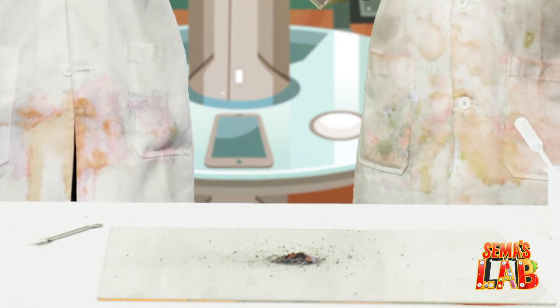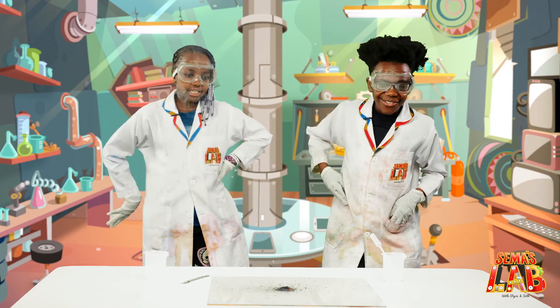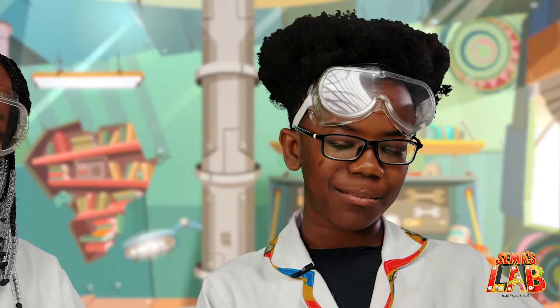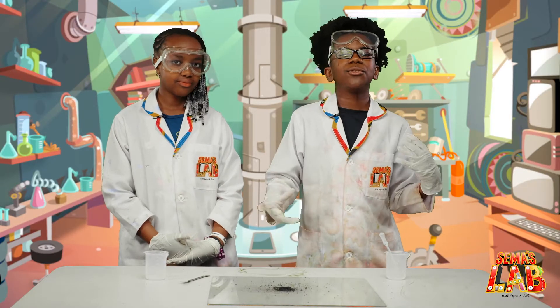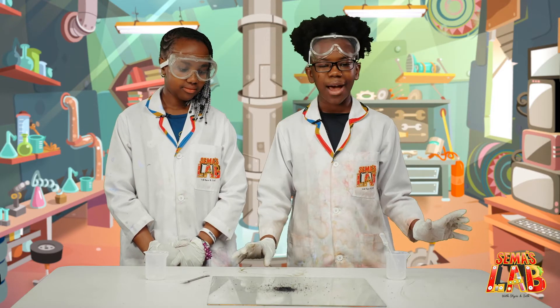That was so cool! That was very cool. Don't step near it right now until it truly goes out. So guys, this isn't really a home experiment to do. I would recommend doing this in a lab, or at least a place where there's a bunch of people who know what they're doing and some adults to help you, because it's very flammable.